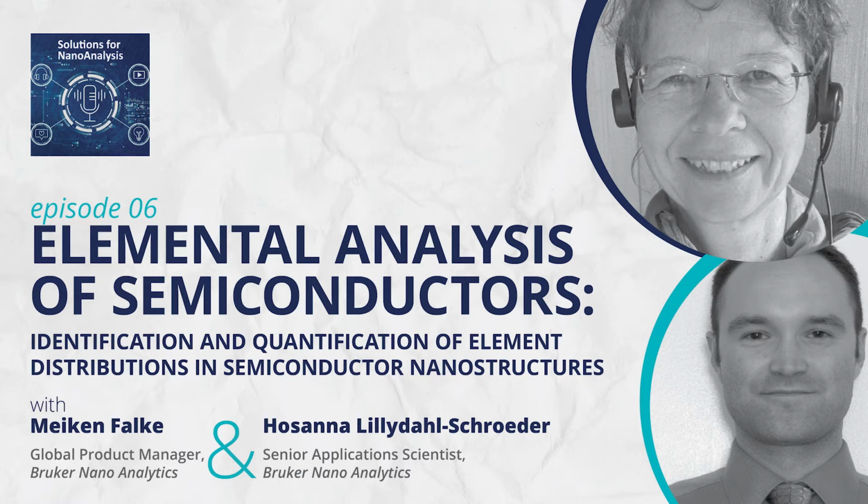So could you give us some additional examples on where and how EDS has some clear advantages versus EELS or other analytical techniques for TEM? Well, to broaden the first example with the lung tissue a bit, of course, in biological specimens, life science as a whole, we always have a mixture of all sorts of elements, light elements, heavy elements, unknown combinations of elements. So EDS is really powerful there.